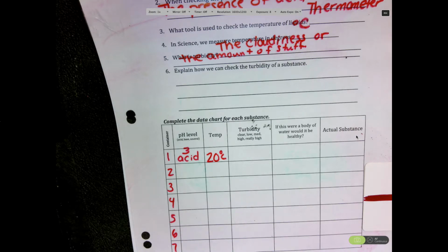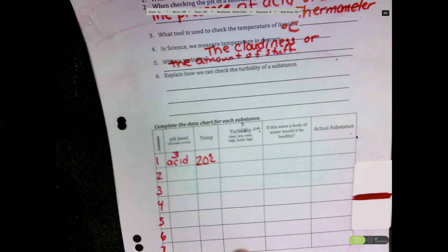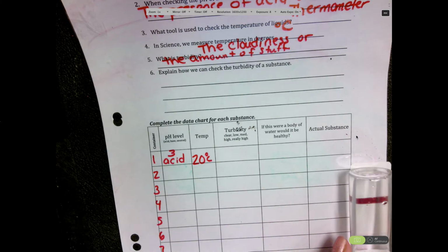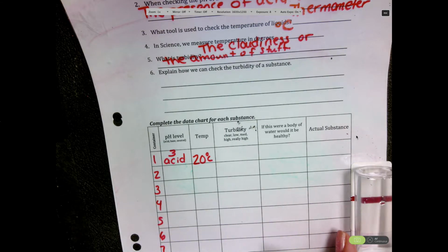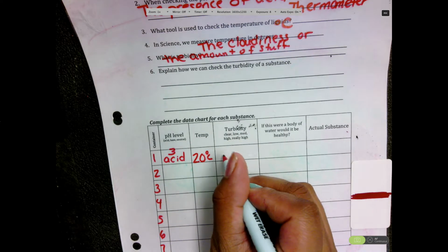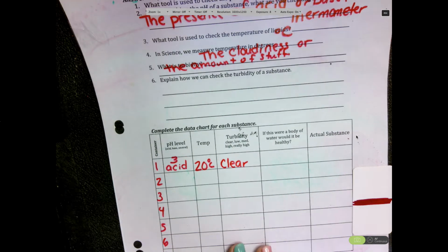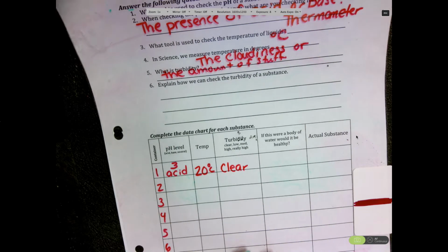And then we're going to check the turbidity. Notice I have a red strip right here. I'm going to check it this way by laying it against the red strip. Would it be clear, low, medium, high, or really high? Clear. All right, remember we have 5 checks that we have to do. One is DO, nitrates, we don't have access to those. So pH level is 3. Does it pass the pH test?